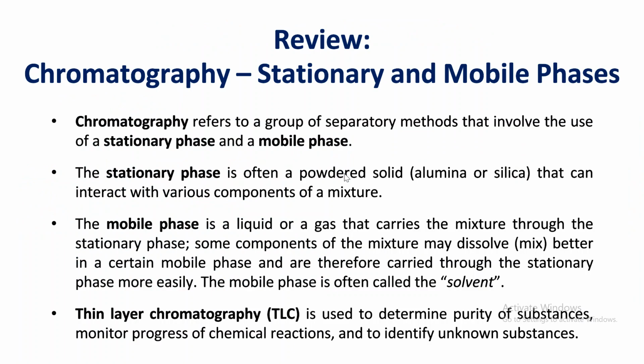Now, let's review the theory behind chromatography. Now, we did talk about chromatography in the last lab, column chromatography. It's very similar. The ideas that we talked about in the last lab are very similar to this lab. The only difference is that column chromatography is used for usually separating bigger samples, and thin layer chromatography is used to separate smaller samples.